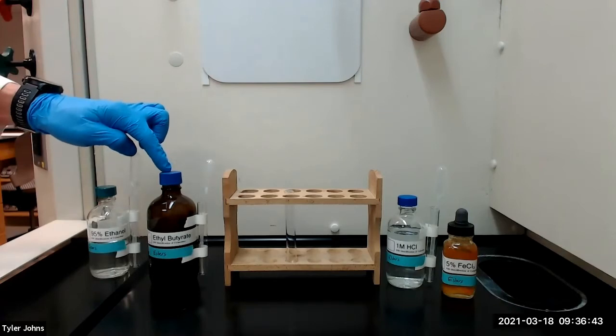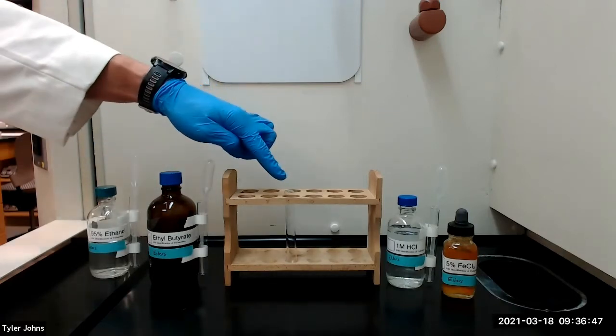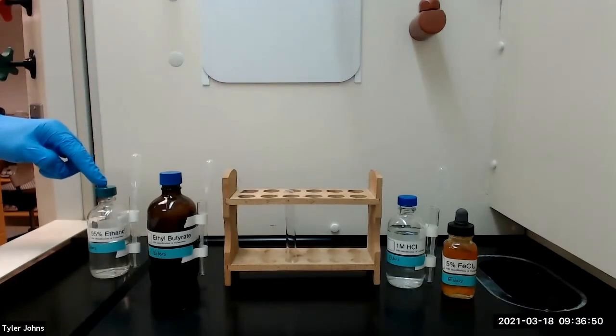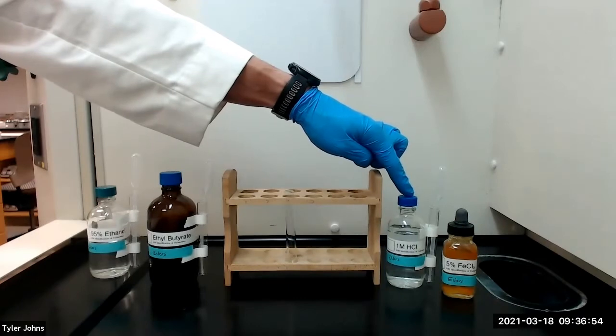We will begin by dissolving a small amount of the test compound ethyl butyrate in a small test tube with one milliliter of 95% ethanol, and we will add one milliliter of one molar hydrochloric acid.